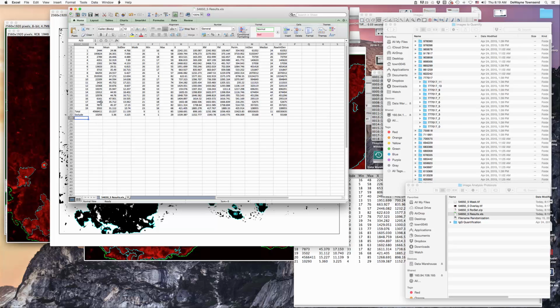And then for the individual areas, we'll look at the sum of these areas divided by the sum of the total area, which will give us the result for that particular image. After we look at all of the images from a mouse, we'll get an ensemble average for that particular mouse.